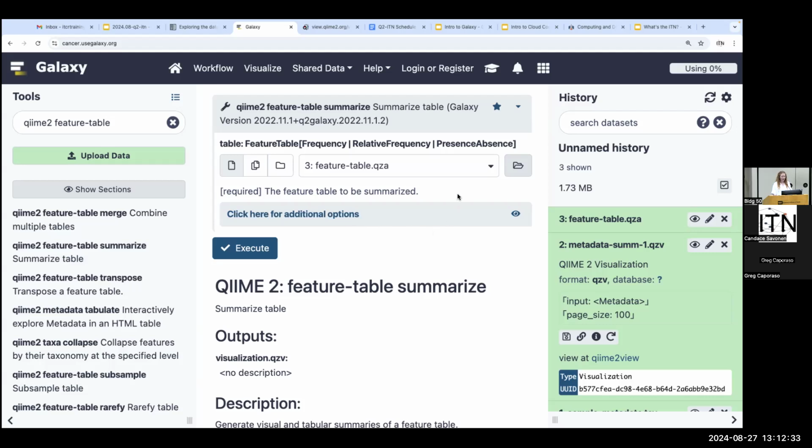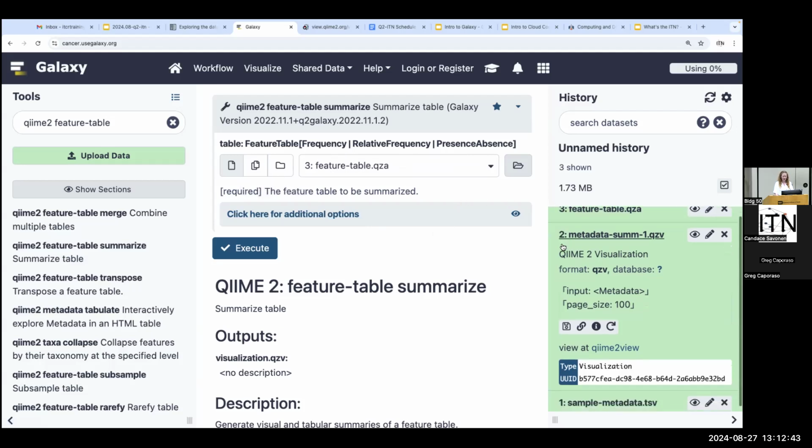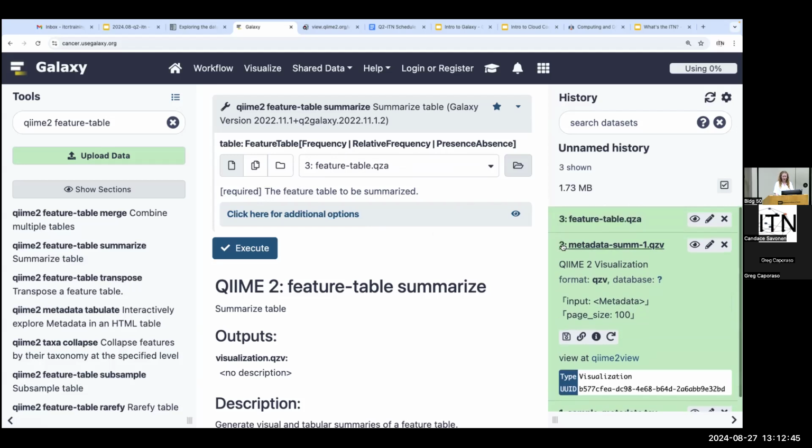All right, and hopefully your feature table is loaded, and hopefully it's also seen here. Something else I'd like to mention is that these numbers here, I think they probably are matching up with yours, but this is just your Galaxy history of artifacts number. This number is not actually attached to your files. It's just inside of Galaxy. You'll have those numbers on there.